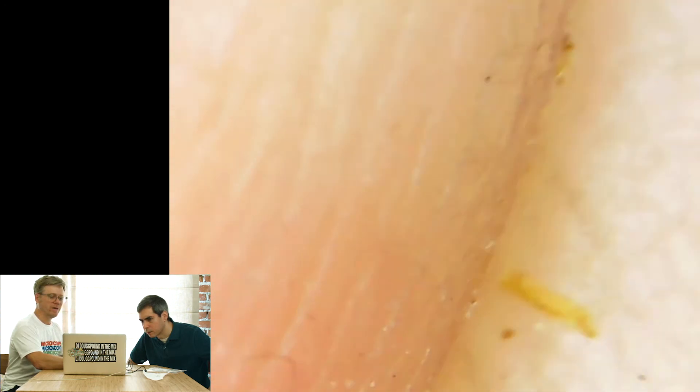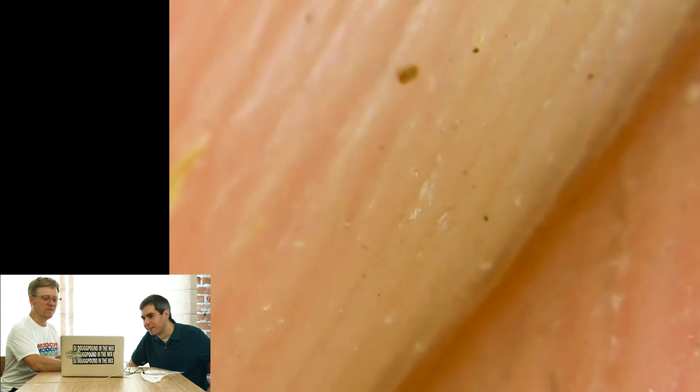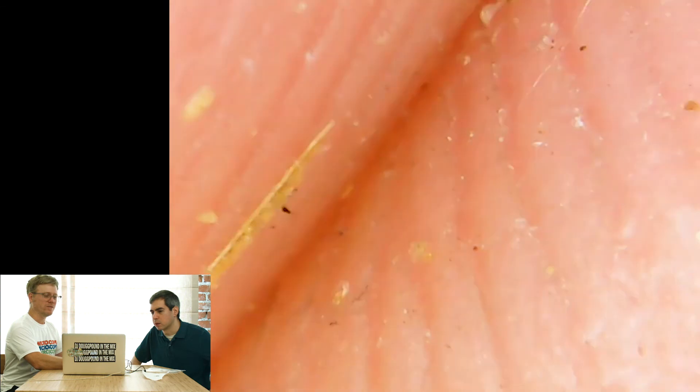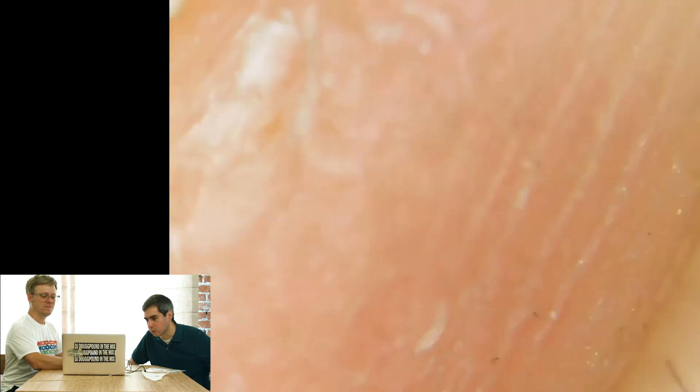Let's look at my fingers. Squeeze the dust — I need dust on my fingers. Let's look. This is my index and thumb squeezing together. Bet you didn't think it looks like that when you go to pinch something? That's what the pinch looks like — you go to pinch someone's cheeks. It looks like some kind of steamroller. Just think, imagine when someone touches your face and they're putting all that stuff on there. They're little particles of things that plug your pores up and you get pimples.